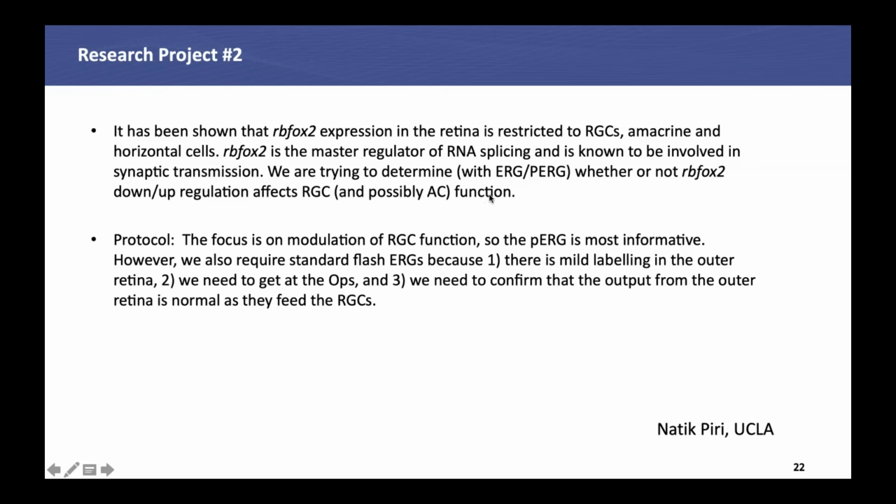What we're trying to do in this project for them is to determine by ERG and pattern ERG whether or not RBFOX2 up or down regulation, which he can do with some of the vectors he has, affects retinal ganglion cell function and possibly also amacrine cell function.